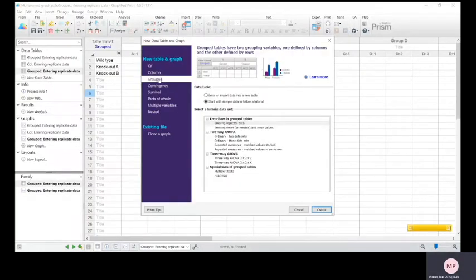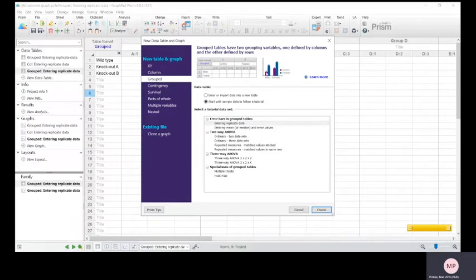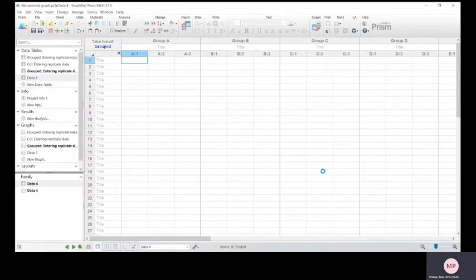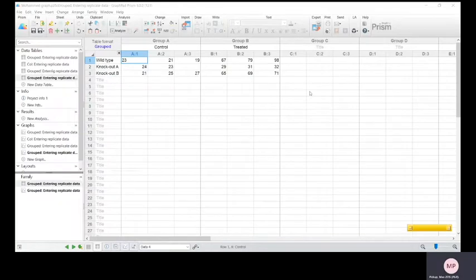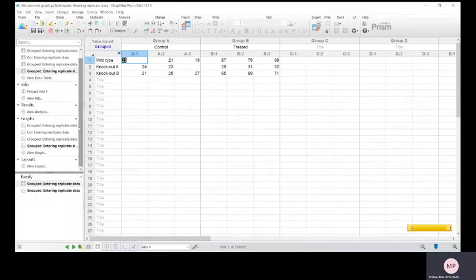For what I'm doing, I want grouped, which tends to be a good one, or column for QPCR data. Just create this and it will kick out some random numbers which I'll play with, and then it will come up with the graph of that data down here.